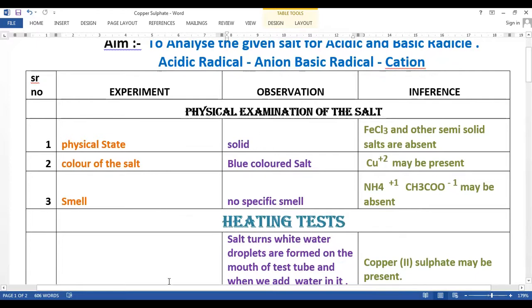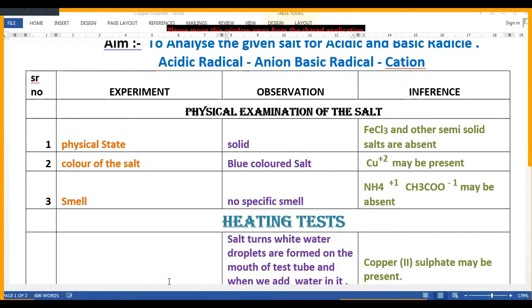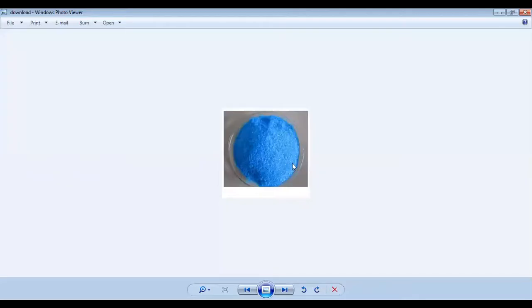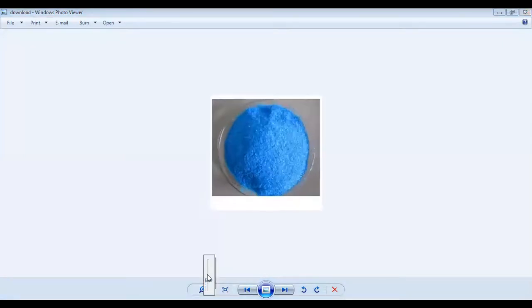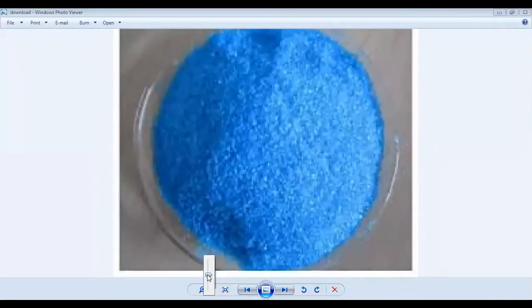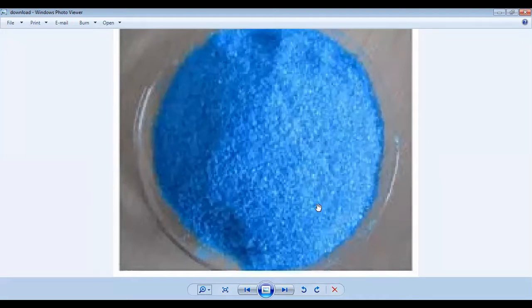Today the salt which is given to us is this salt that we have. You can see the salt. It is a solid salt, a crystalline salt, blue in colour.